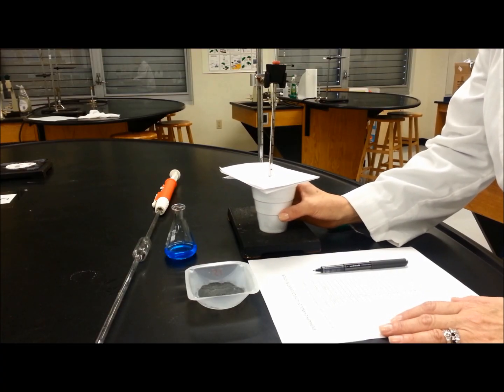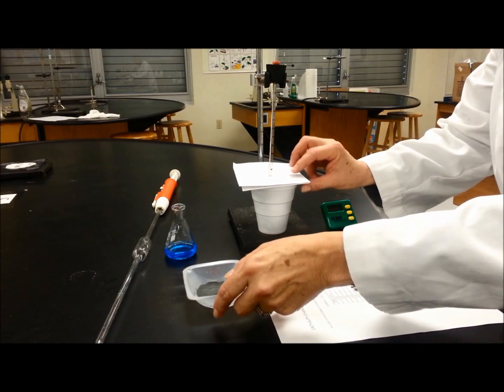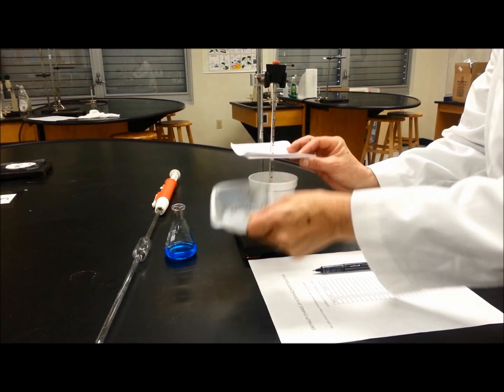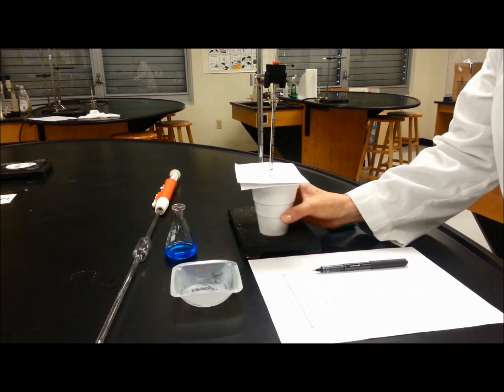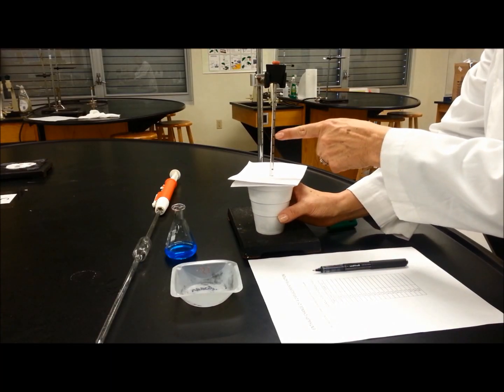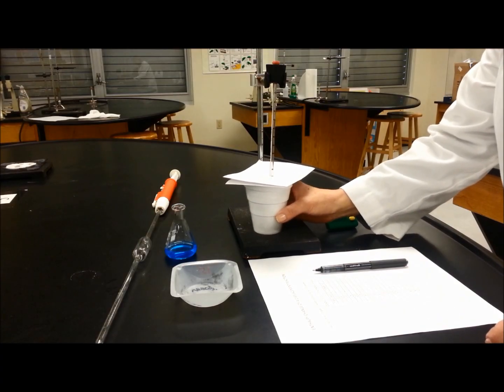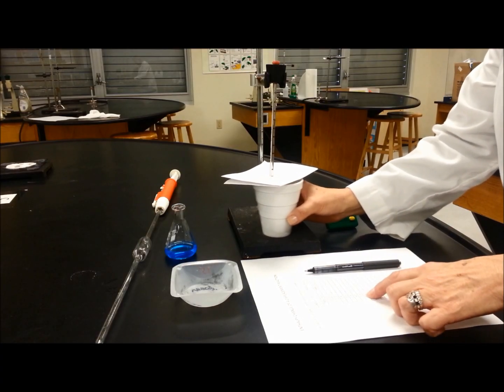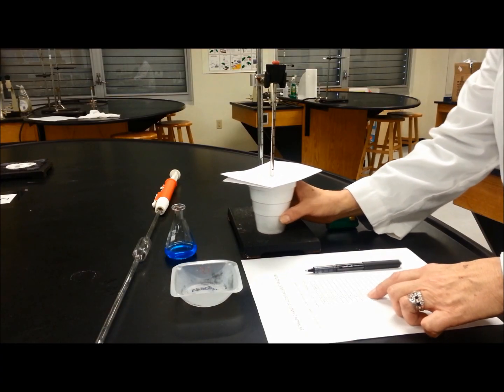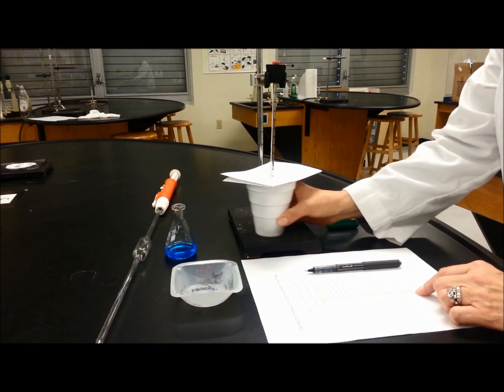When the time gets to exactly 3 minutes, you are going to open the lid, put all the zinc in at the same time, and continue swirling while watching the temperature rise. Then continue measuring every 30 seconds until you get to the 9 minutes.